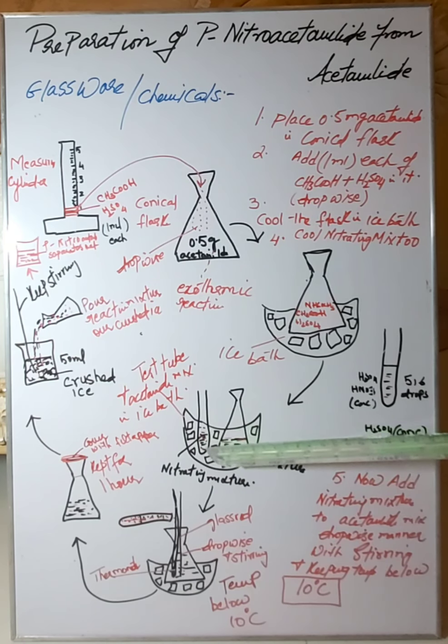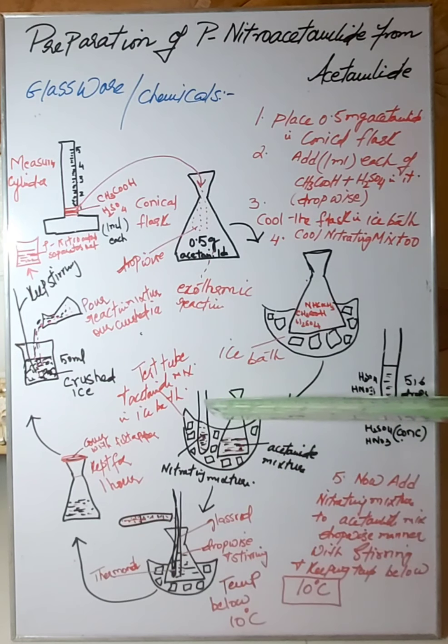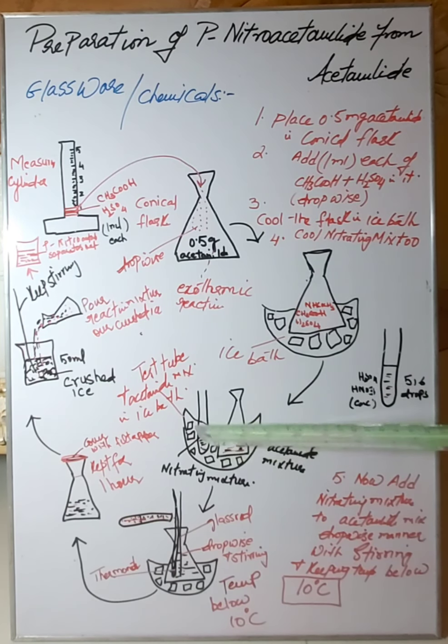Because they might be having an exothermic reaction, we do not need to exceed the temperature. So now add this nitrating mixture to the solution of acetanilide in a dropwise manner, or drop by drop, with stirring and keeping the temperature below almost 10 degrees centigrade, or, you can say, below 5 degrees centigrade.